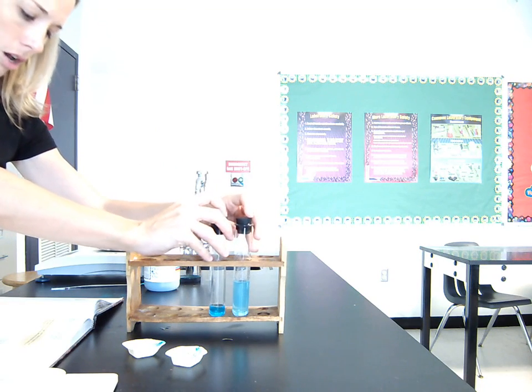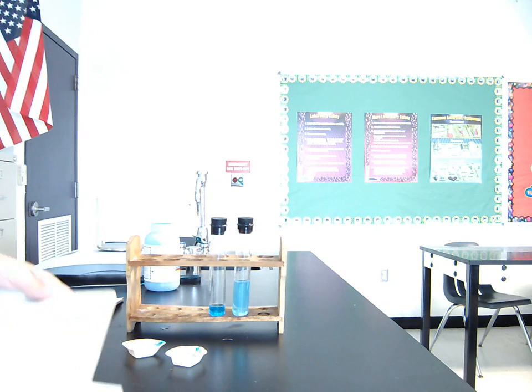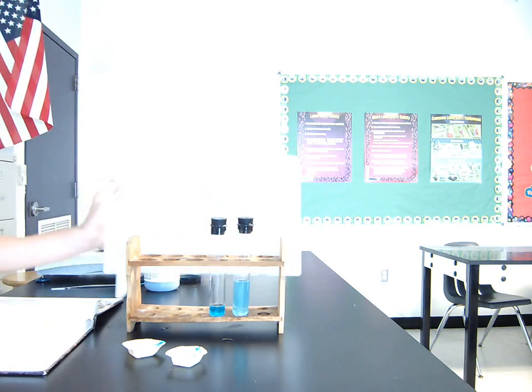So the first blue dot question says, did it all dissolve? So yes, the solid does dissolve in both test tubes. It dissolves completely. I wonder if I put this back here, you can see it a little bit better. Oh yeah, that's good. Okay.